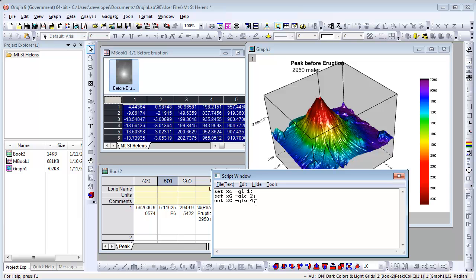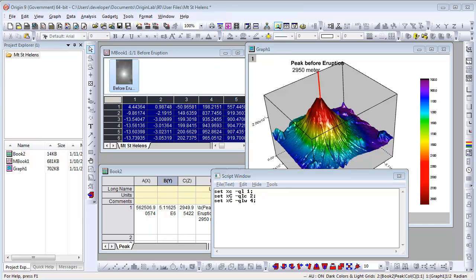You can also change the line color and line width. In 9.0, we only have LabTalk access for these commands. You can look up the set command help for details. We will add GUI support for this in the future.